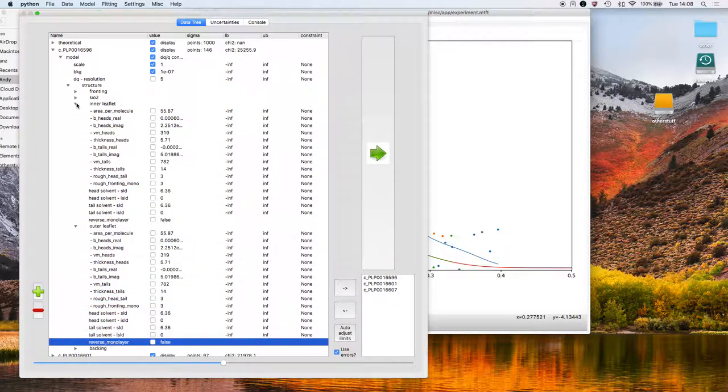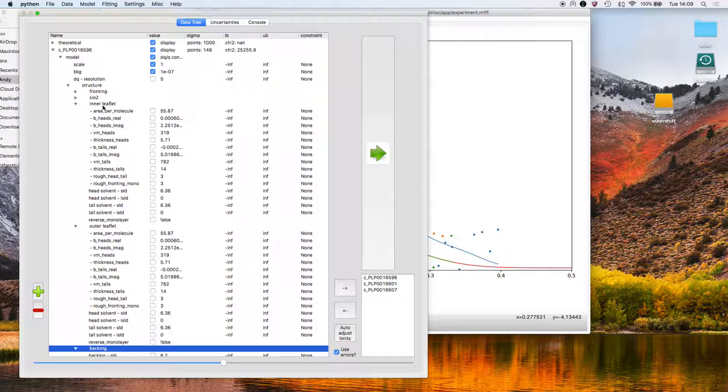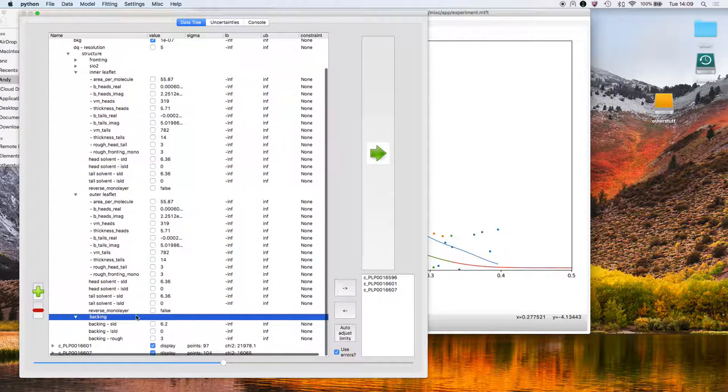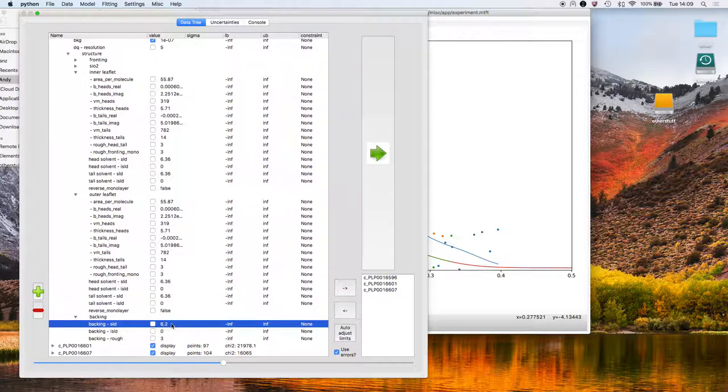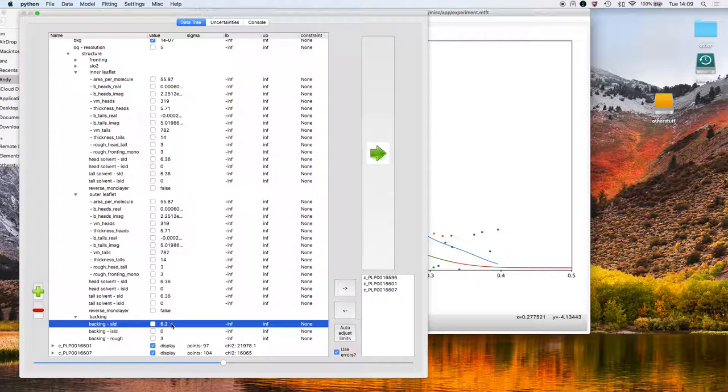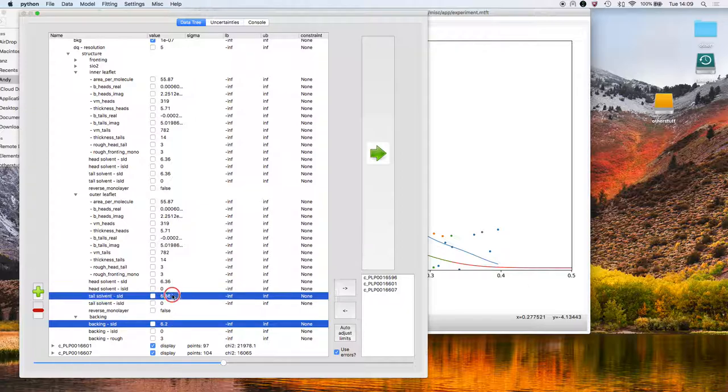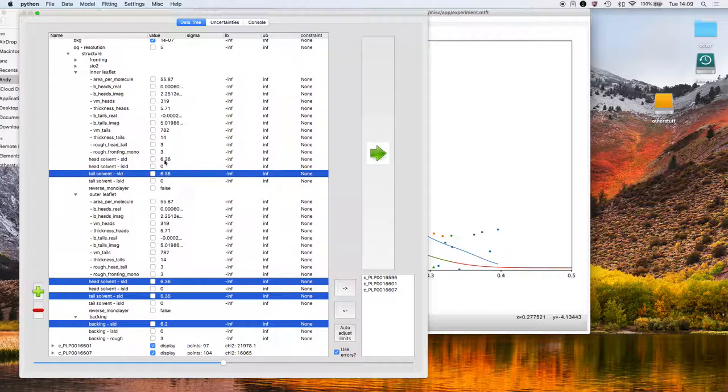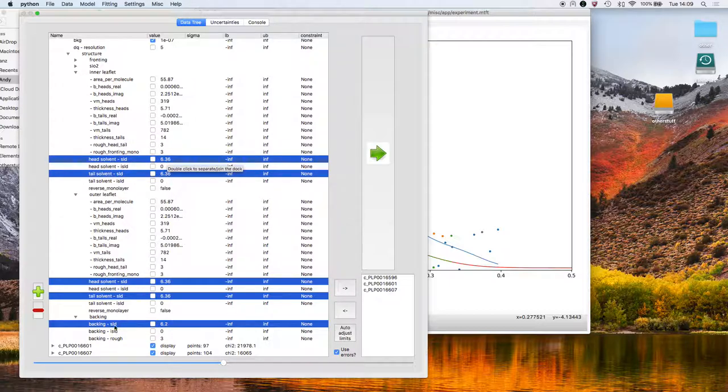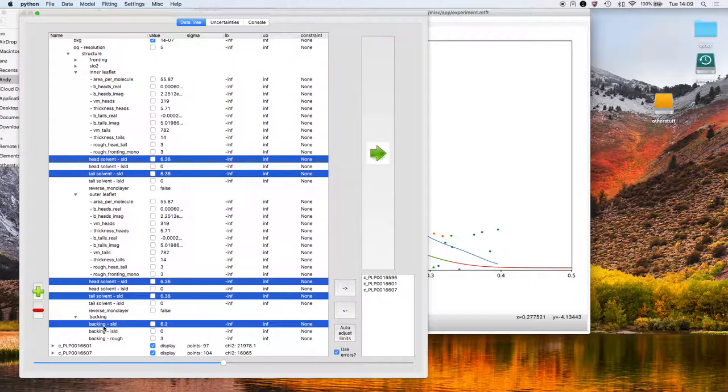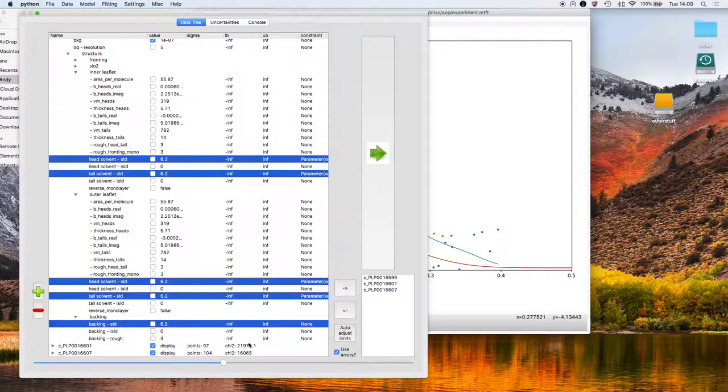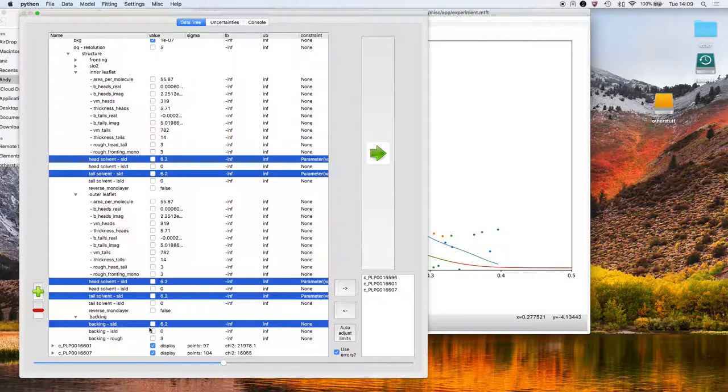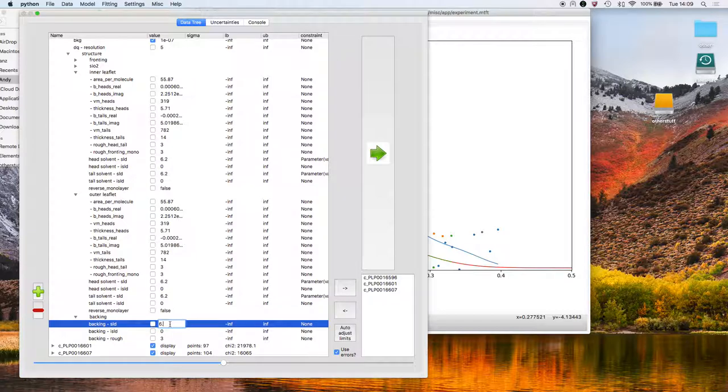First of all, you'll see for the leaflets we have tail and head solvent. That enables us to have a different solvent solvating the inner and outer leaflet and indeed the head or tail regions of each of those leaflets independently, which is of use when, say, you're analyzing an air liquid monolayer. So I've selected all the scattering length densities for the solvent for the inner and outer leaflet for both the head and the tail. And I've also selected the SLD of the backing medium. If I right click here, I can click on link parameters. You see now that the head and tail solvent for each of the inner and the outer leaflet is fixed to that of the backing SLD. So if I change the backing SLD to, say, 6.3, then they will change concurrently.